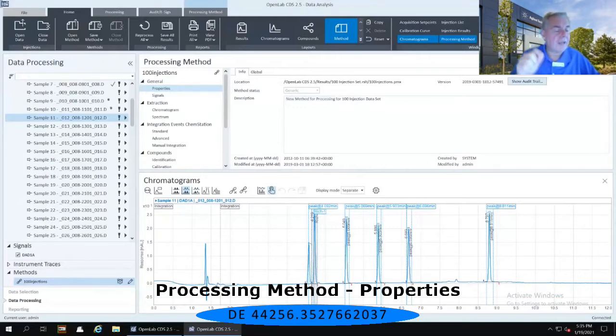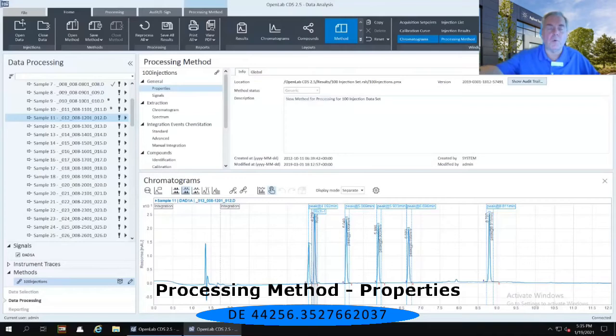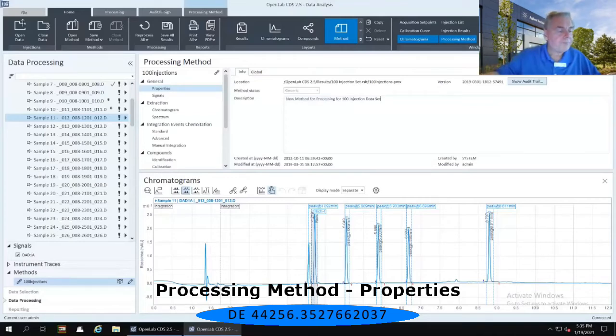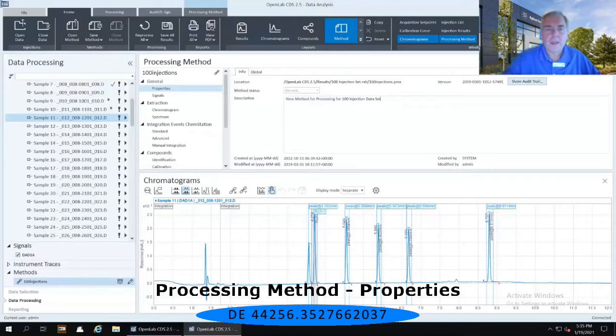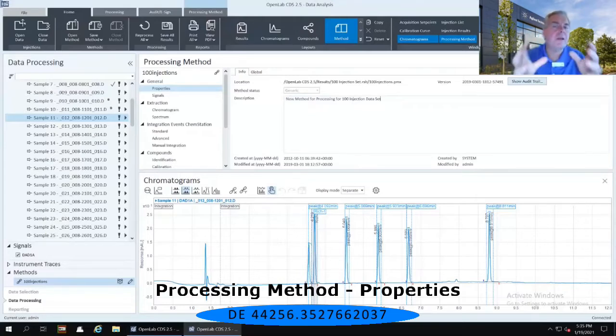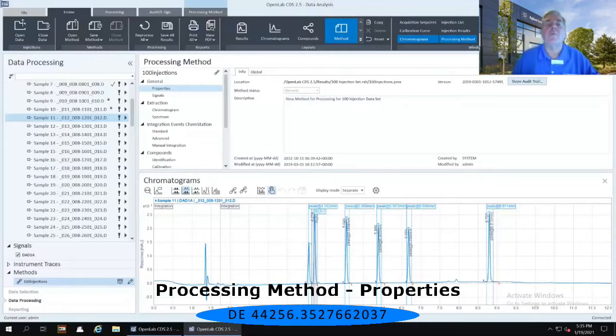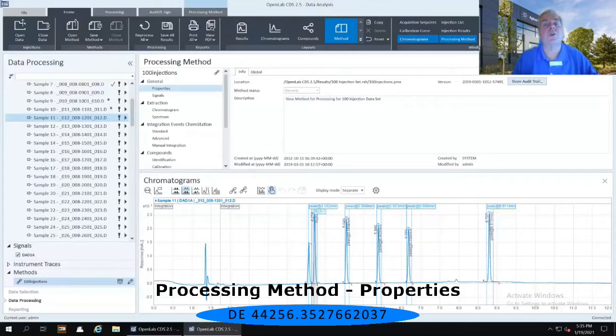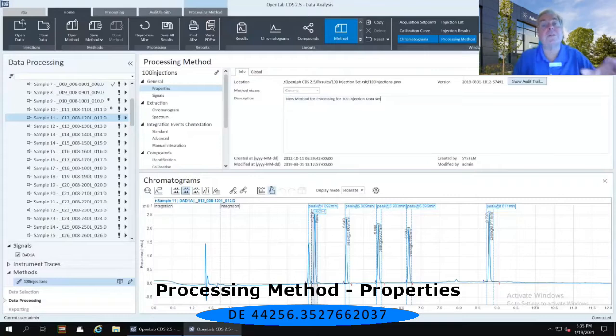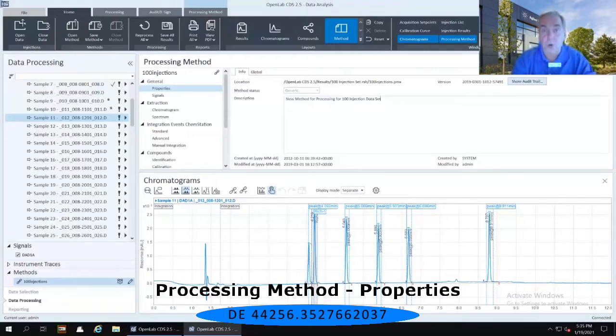Now, for those of you that were with me last week, you'll remember that we looked at specifically the control panel and the acquisition portion of the software. And remember that I told you at the time that the acquisition portion of the software does not cover anything like integration, calibration, and report generation because that is for the data analysis portion of the software.